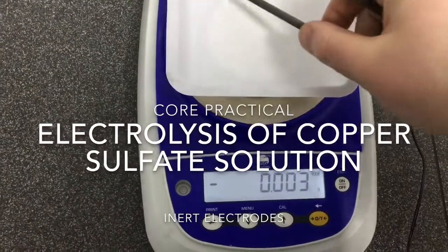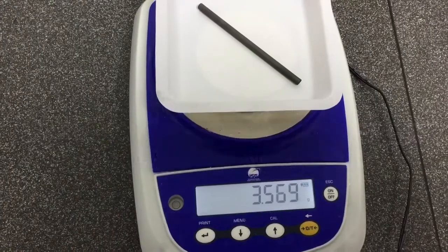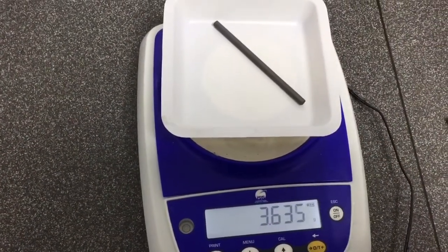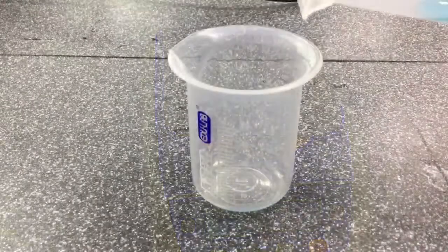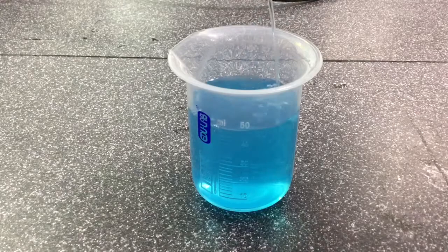In this experiment we'll be looking at the electrolysis of copper sulfate solution using inert electrodes. The first step is to weigh the mass of two different graphite electrodes and to keep a note of these. Our next step is to measure out 50 centimeters cubed of copper sulfate solution.